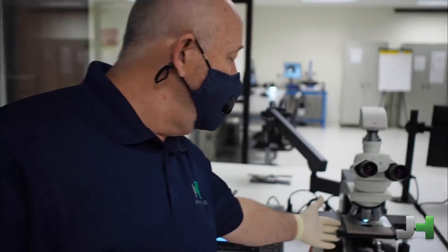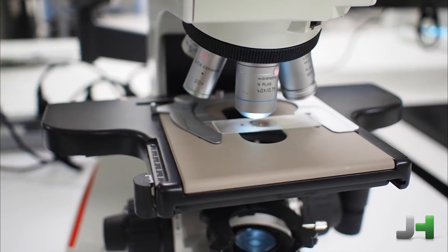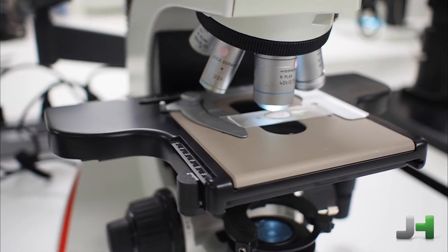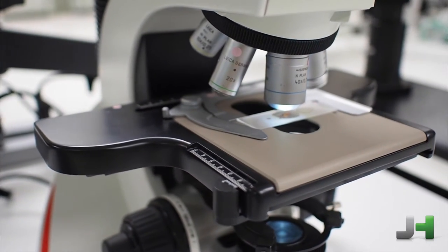Over here, we have a compound upright microscope used typically in the clinical world for hospital histology applications, urinalysis, a variety of applications in the clinical field.